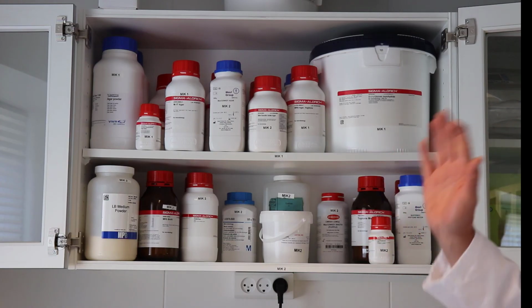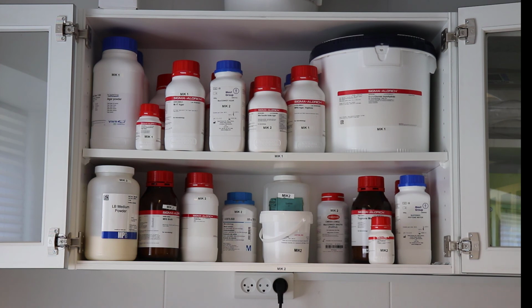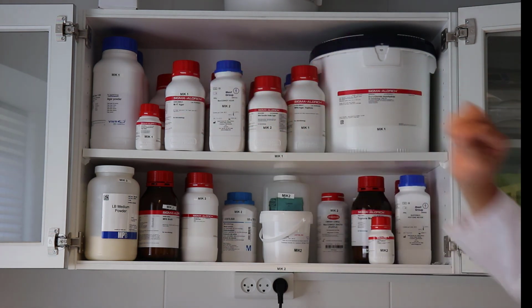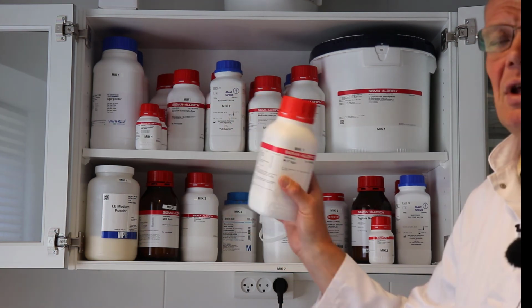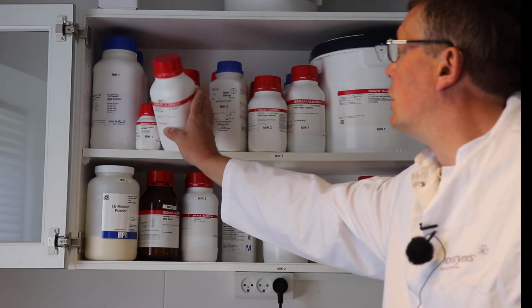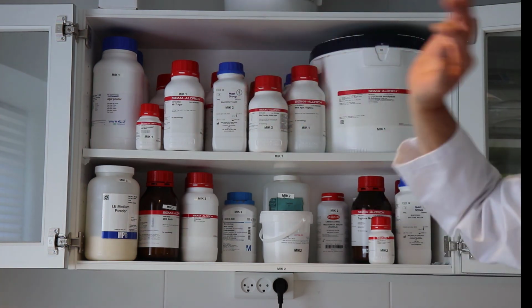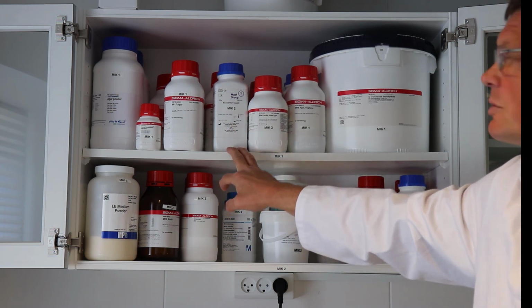Here you see the cupboard in the lab where we have the different media and things for microbial growth. And on the top shelf we have a lot of different selective media which can be used to identify bacteria, because it will be possible for it to select for growth of only specific bacteria. We have the M17 agar, which is used to detect lactic streptococci. We have something called MacConkey agar, which is used to select for gram-negative bacteria. There's something in here that inhibits growth of gram-positive bacteria.